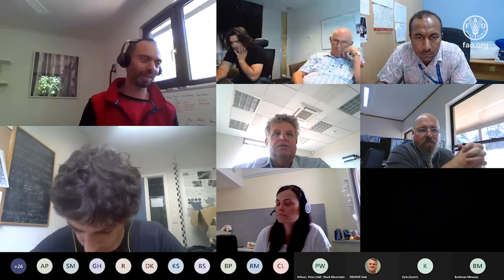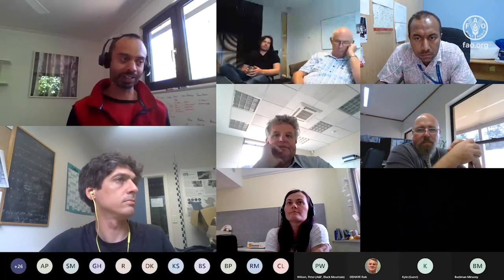As Manu mentioned, we've got a pretty strong focus on soil organic matter and in particular types of organic matter, which we simplify using a fractionation process. And as Manu said, it's pretty time consuming and expensive to do, but it can be predicted reasonably well. And we've got a growing library of samples that have been fractionated, and we're thinking about how we can ship that capability out so it gets used by real people in the real world, not just researchers. There's a growing interest by government and industry as well, because fractions can tell you not just how much carbon's there, but things like how it's going to cycle, how it's going to respond to perturbation, and even things like mineralization of nitrogen. So we think there's quite a lot of value to be unlocked, and we're working towards how we can do that in a way that we can continue to improve those predictions, but also people's use of the data that comes from it.